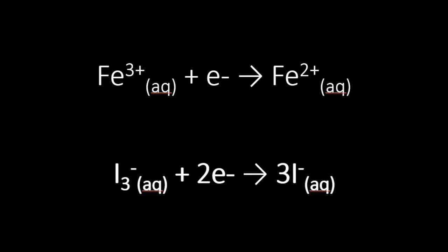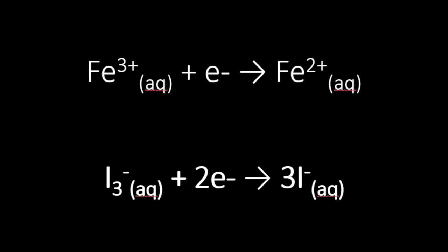For this part, we will be pairing our iron half reaction with the iodine half reaction.